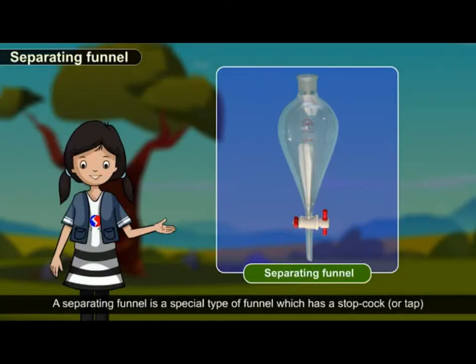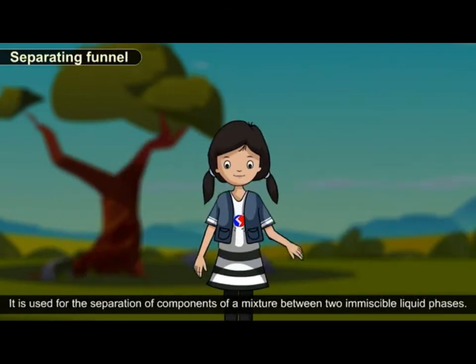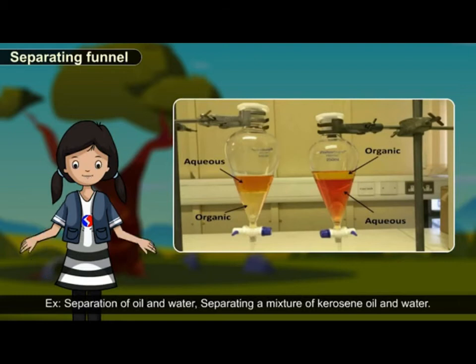Separating funnel. A separating funnel is a special type of funnel which has a stopcock or tap in its stem to allow the flow of a liquid from it or to stop the flow of liquid from it. It is used for the separation of components of a mixture between two immiscible liquid phases. One phase is the aqueous phase and the other phase is the organic solvent. This separation is based on the differences in the densities of the liquids. The liquid having more density forms a lower layer and the liquid having less density forms the upper layer. Example, separation of oil and water.